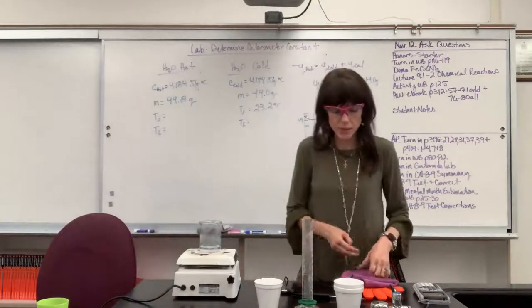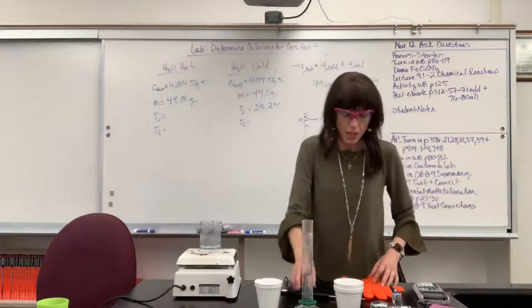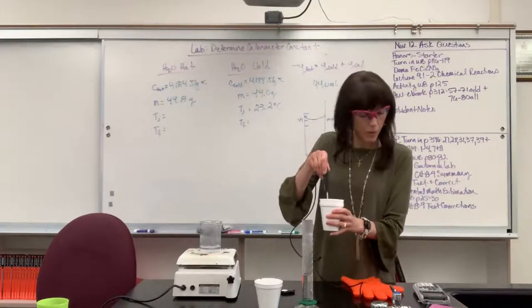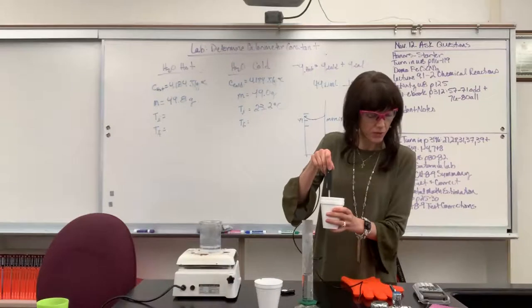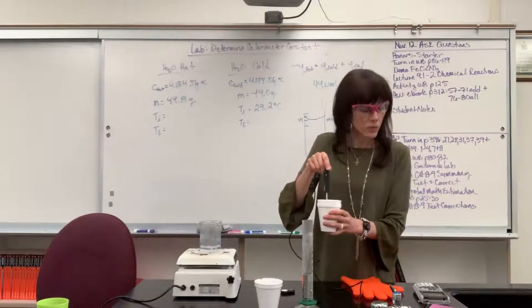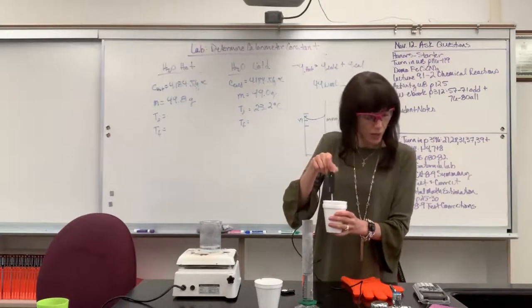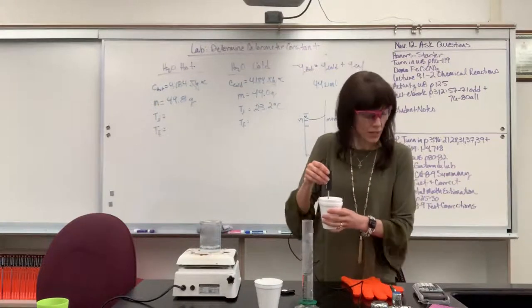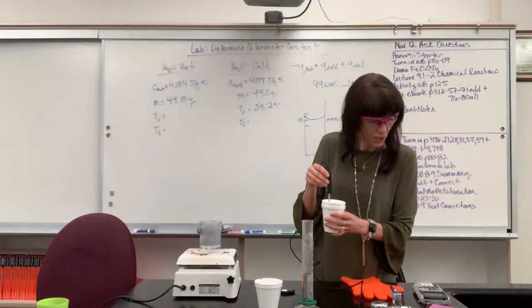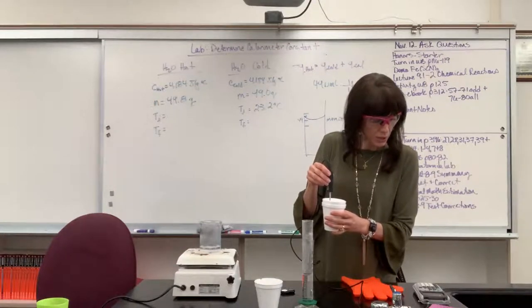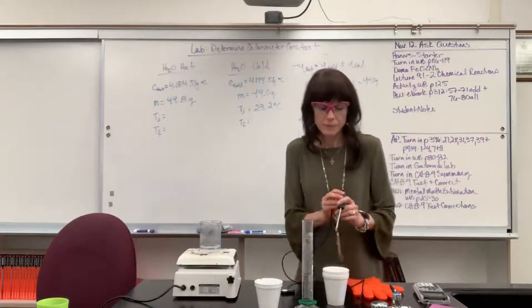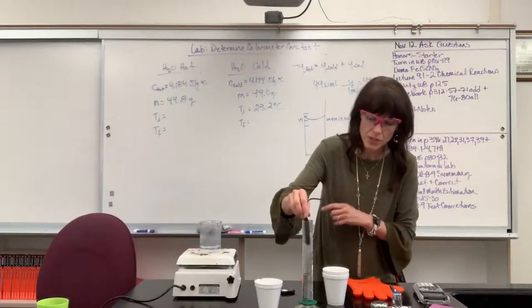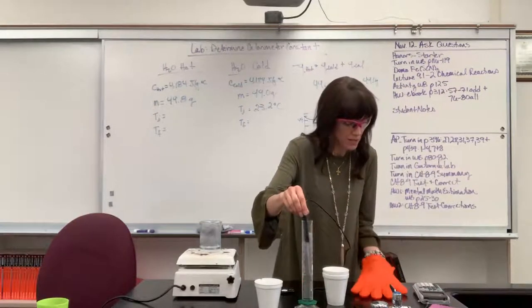Now, here is the speed part of this. I'm going to take the temperature and then quickly pour it in here. One more time, I want to make sure that this is still stable at the 23.2, that we're at thermal equilibrium between the cup and the water. And it's going to be at thermal equilibrium with the classroom as well, just our air temperature. Yeah, we're still at 23.2. Awesome. Okay, so I take this temperature in here, and I get ready to pour fast.